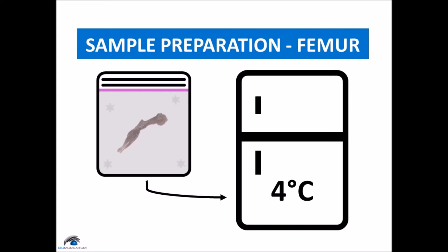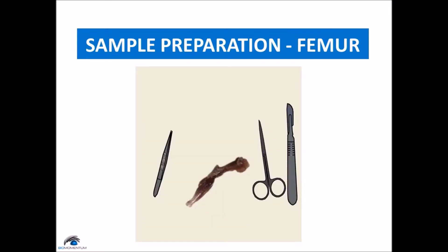Then place the leg on the cutting board. Remove the tissue around the hip joint and cut any ligaments or tendons so that the hip bone can be removed from the femoral head. This can be done using either a scalpel or fine scissors.